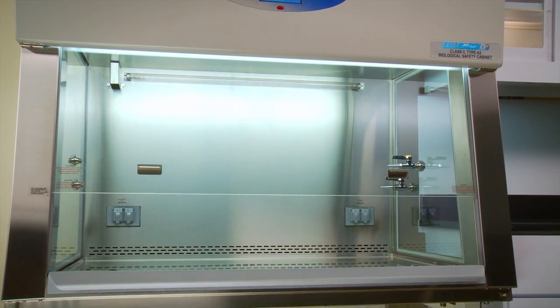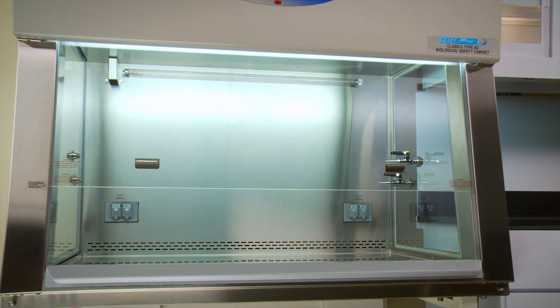When you work in a NuAir BSC, you'll experience a comfortable, ergonomically designed workspace.